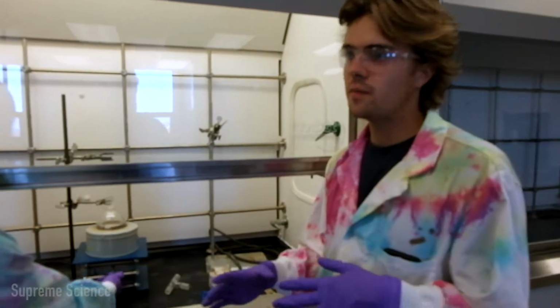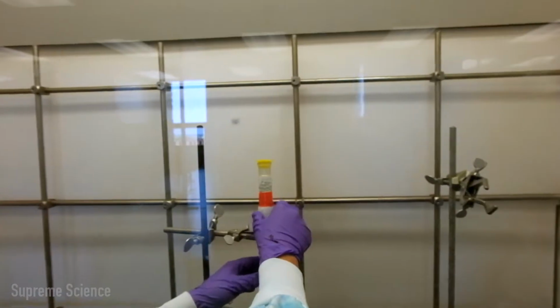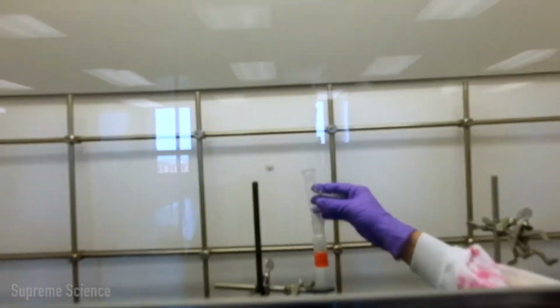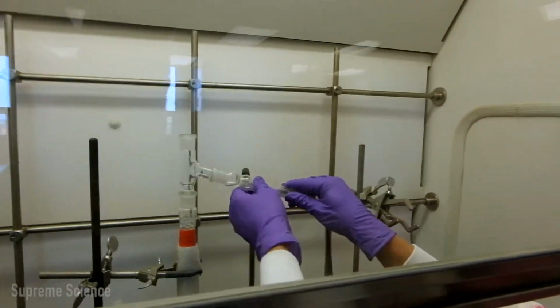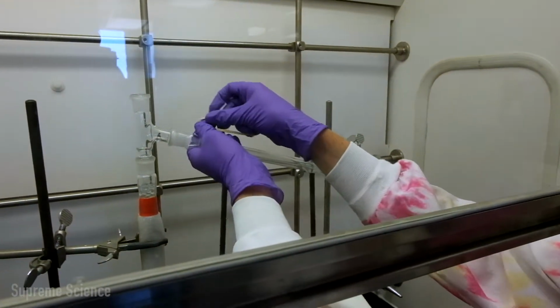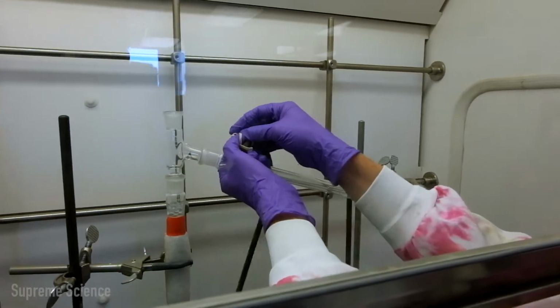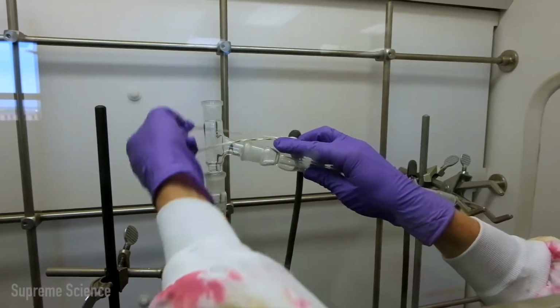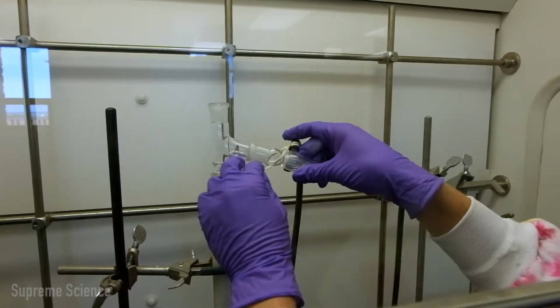The interesting piece of equipment for a fractional distillation setup is our column with glass beads. We're going to clamp that in above our flask, and that's going to go between the flask and our still head. And then we're going to attach our condenser with our water tubing already connected, and we're going to secure that with an elastic band. There's a little hoop technique that allows you to secure it to the water tubing, and then you're going to pull it around the column to secure it in place.